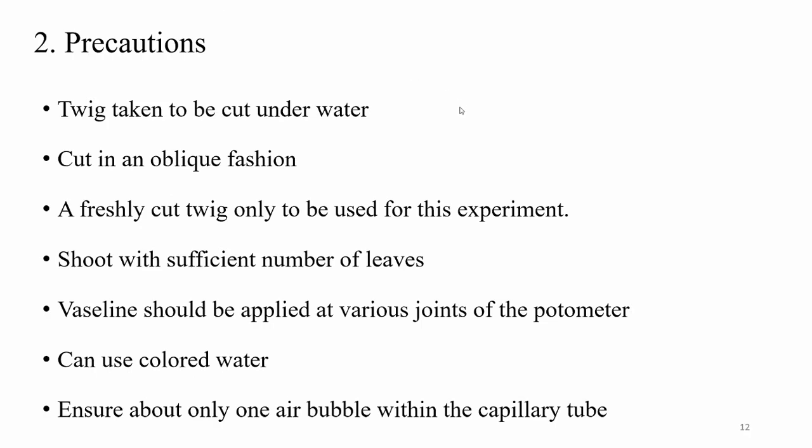Ma'am, slant position, ma'am. Slant position is somewhat not horizontal and not vertical, somewhat like that.